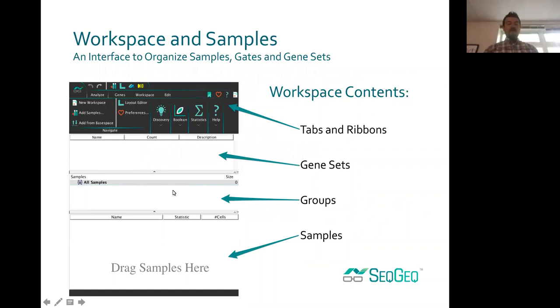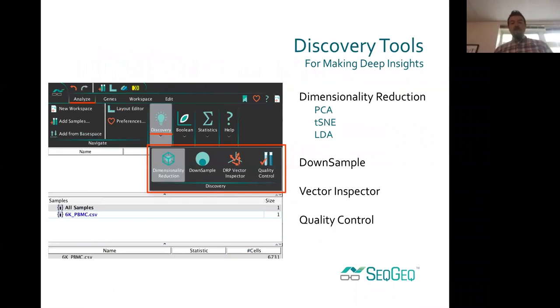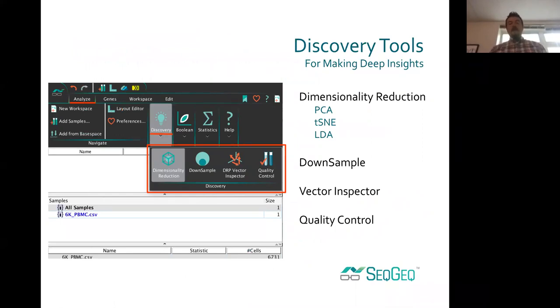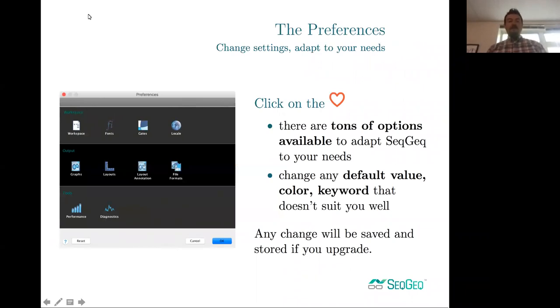We also have an area for samples or groups and samples. This is where you're going to do most of the work in analysis, at least to begin with. There are also discovery tools available, including dimensionality reduction — a key starting point to most single-cell RNA-seq analyses — as well as downsampling, a vector inspector for principal components, and quality control, which we highly suggest you utilize. Within preferences, accessed via the little red heart icon in the top right, you can change various default settings.